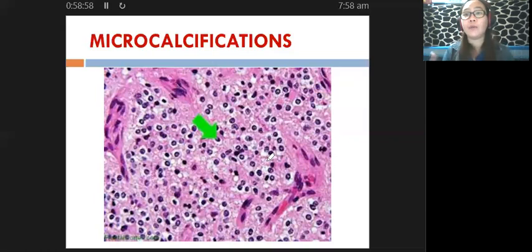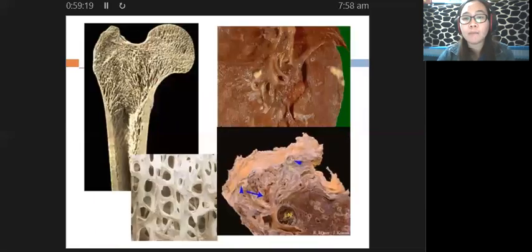Okay, it's fine po. Okay lang siya. Alright? But of course, if you are able to detect it during sectioning, that means it is interfering with that particular step. And what do we do? We perform surface decalcification. Okay? Ayan. So, I will just be showing you some pictures.